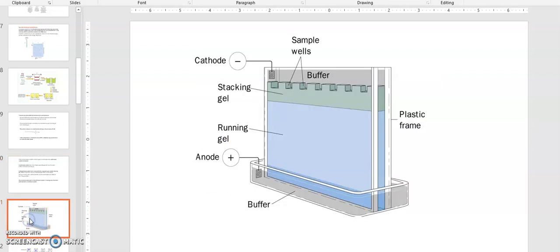For example, this is a discontinuous gel, so you have a stack of two separate gels together. Okay, you may be able to buy something like that. So the bottom part is considered the resolving gel, and the top part is considered the stacking gel. The stacking gel is a low percentage gel, and the bottom part is a higher percentage gel.